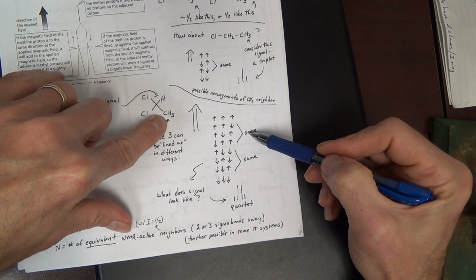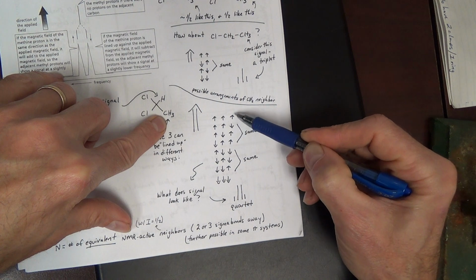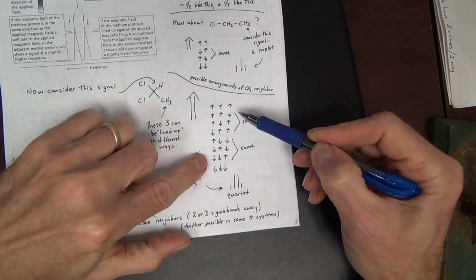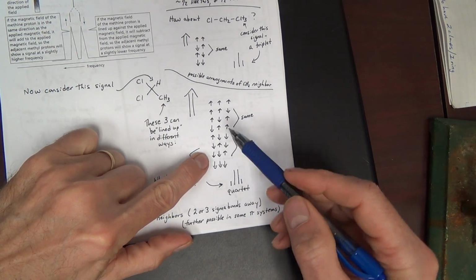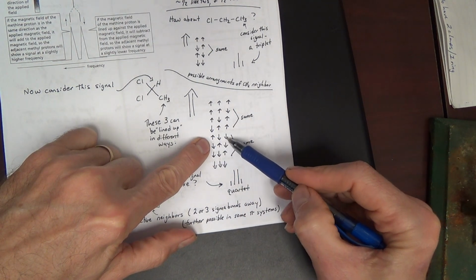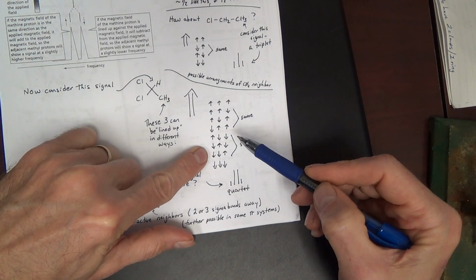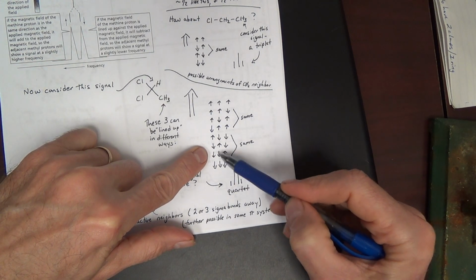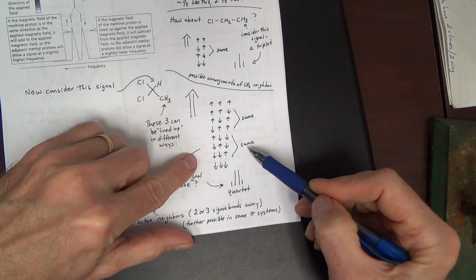So it's just one scenario, but it's 3 times as likely as that original scenario. Now, we can also have a 4th scenario where 1 is lined up with the external field, but 2 are opposing it. And there's 3 different ways to have that, as shown here. But again, if these H's are the same, these 3 scenarios are each the same.